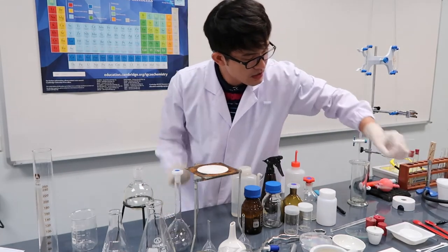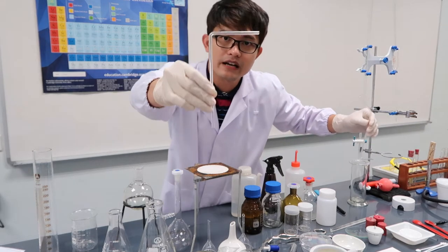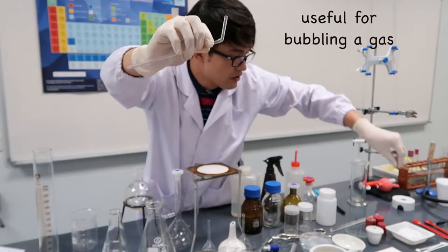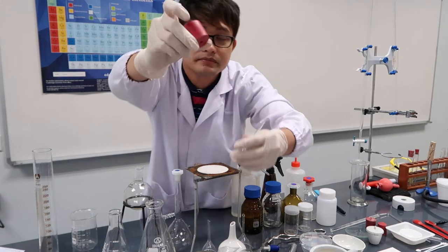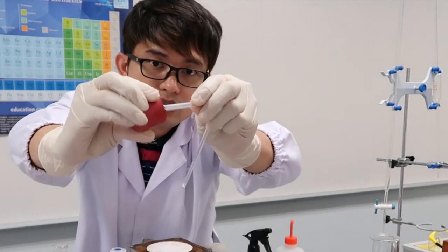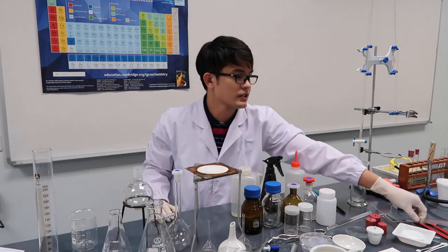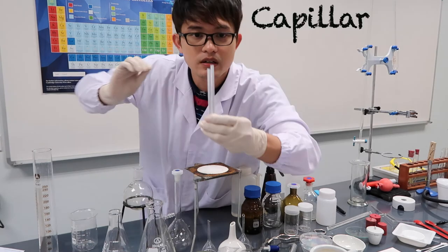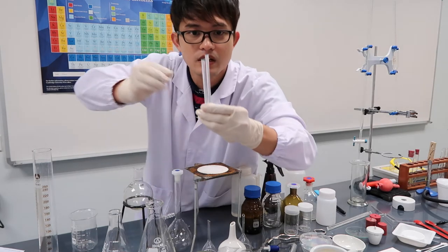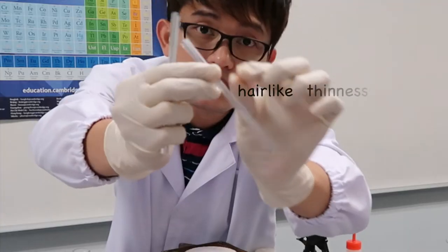These are delivery tubes — this is a right-angle delivery tube, usually inserted into rubber stoppers like this. And this one is a capillary tube — it looks like a delivery tube but the difference is the hole in the middle is extremely narrow, which produces capillary movement inside.